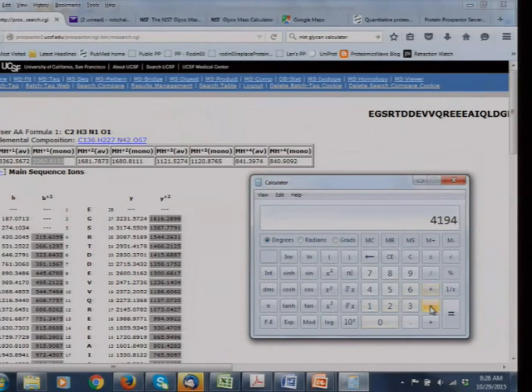So we've got 3360 and 4194. So take away 3360. So it's 834, and this has got the HexNAc attached. So if I add 203 on again, I would have the mass of the whole sugar. 1037. Have I done that correctly? I hope so. That doesn't sound right.